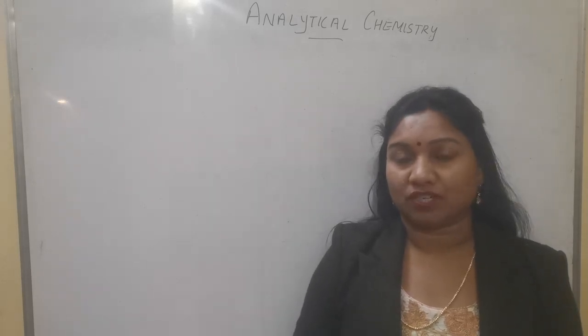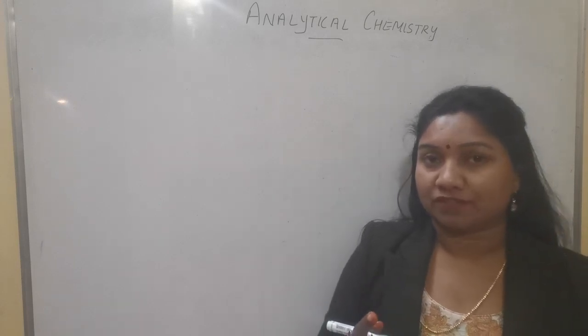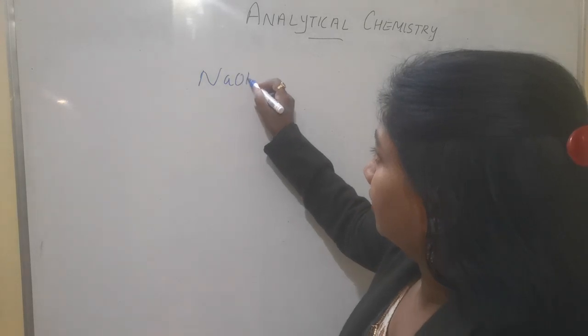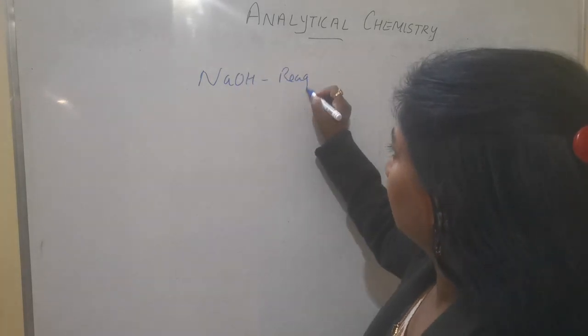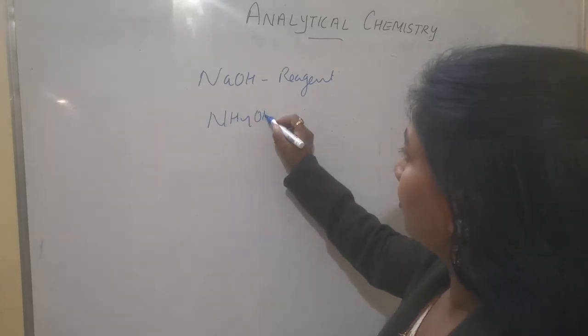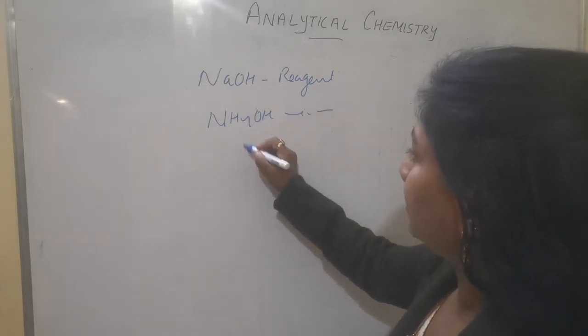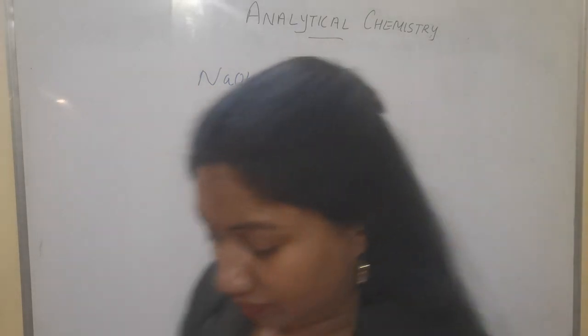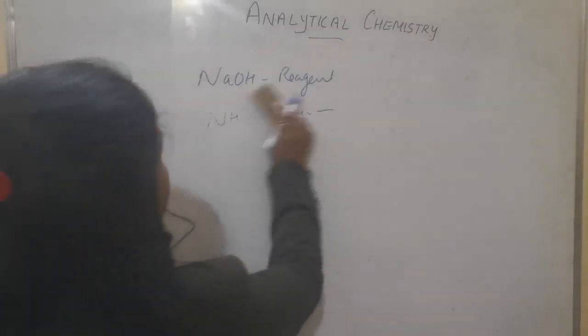So we are dealing with qualitative analysis, in which we have studied sodium hydroxide reagent, and today we have to see ammonium hydroxide as reagent and its action on certain salt solution. So let's start one by one.